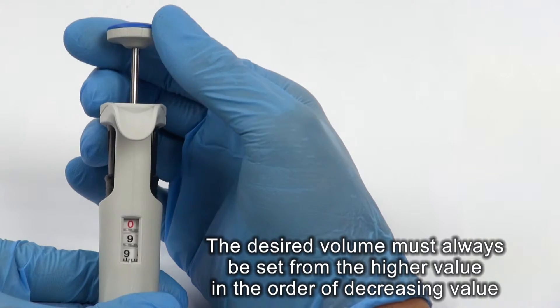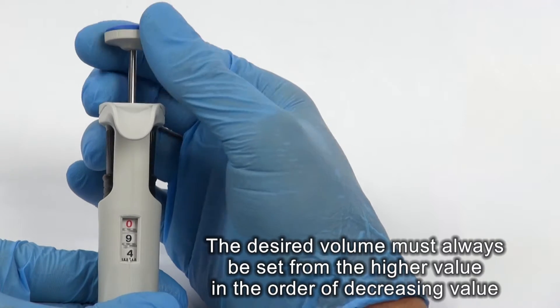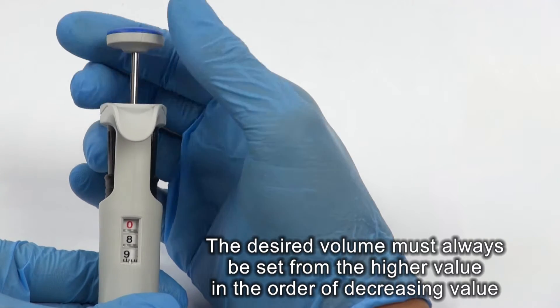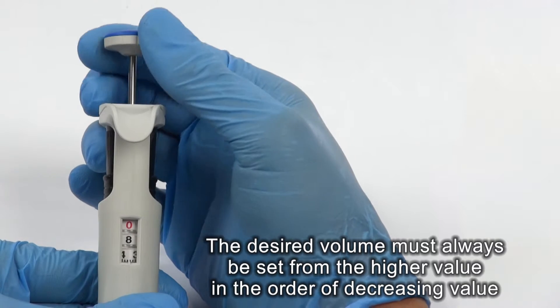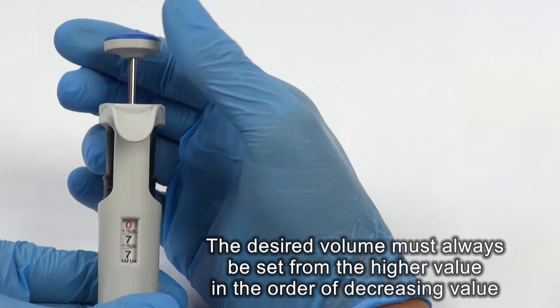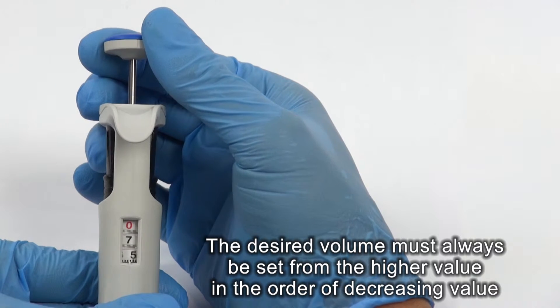If the desired volume is lower than the set volume shown by the counter, turn the counter in the direction that diminishes the counter readings to the required volume. Avoid passing this value.